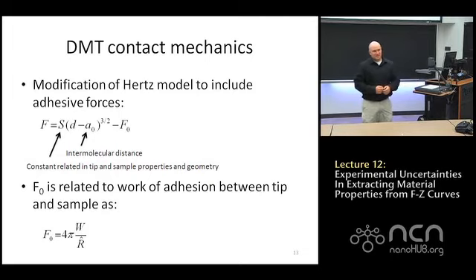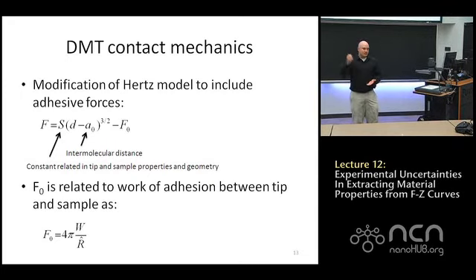In this case, we're forced to go to more complicated models because our system's not so straightforward. It'd be great if we could just take this nanomaterial and do a stress-strain test on it, but how do you pick up a material and measure a stress-strain test? There are clever ways of doing similar experiments, but this is probably the simplest way to get to these numbers, and using these numbers involves modeling the AFM tip and indenting the material. So instead of a simple linear stress-strain curve, we now have this force-distance curve, and the model is just more complicated.